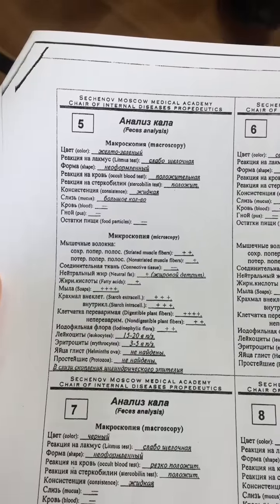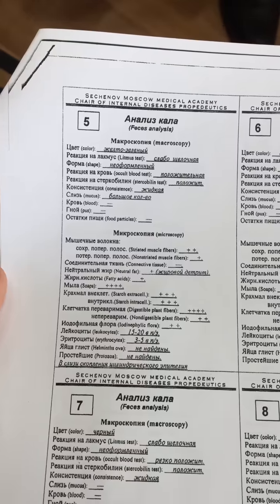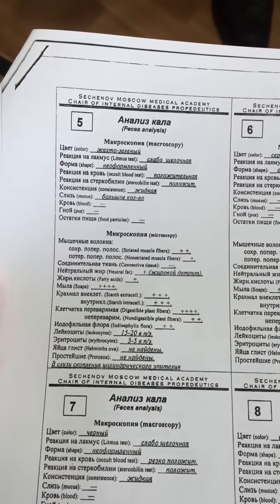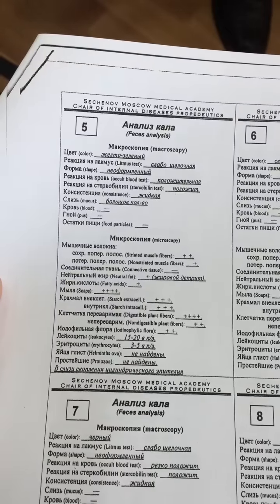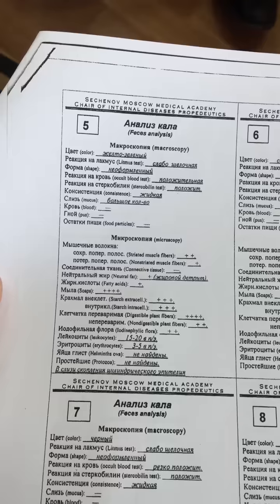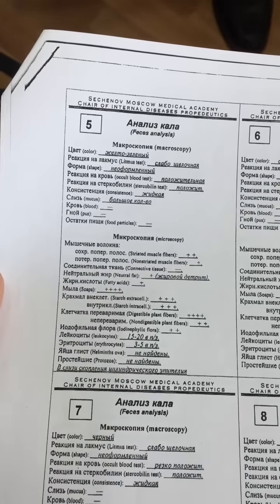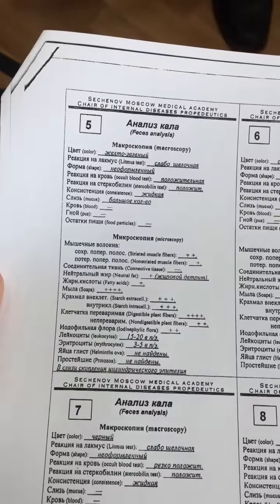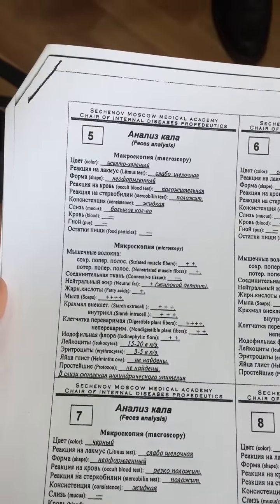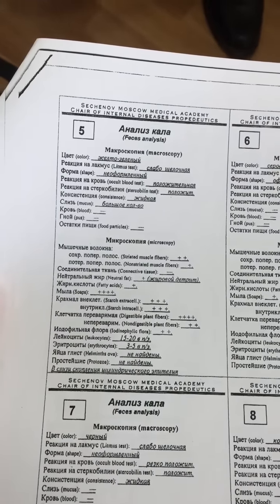Striated muscle fibers, 2 pluses, neutral fat, жировой detritus, it means we have degraded fats, yes, a small number of fatty acids, a lot of soaps, a lot of starch, and we have a lot of digestible plant fibers, and also leukocytes, erythrocytes, and a lot of cylindric epithelium.